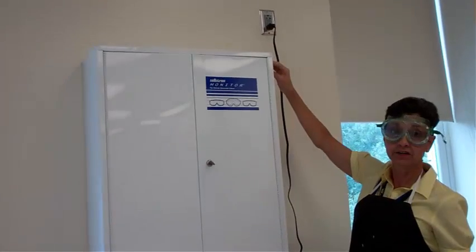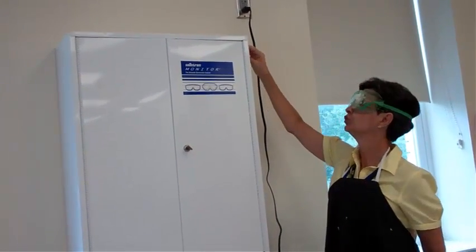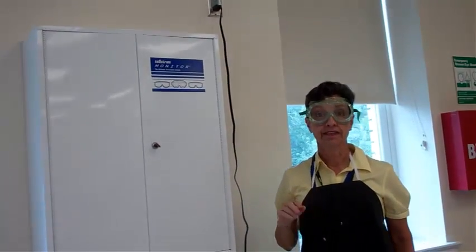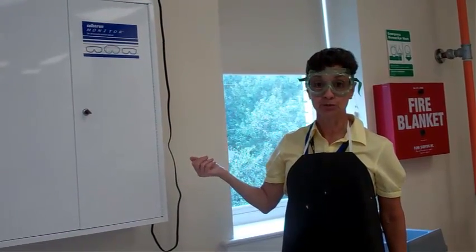There's a knob here that I'm going to ask the last person in the lab to turn on. You will turn it all the way to the back and then let it run. That sterilizes the goggles and makes them 99.9% germ-free.